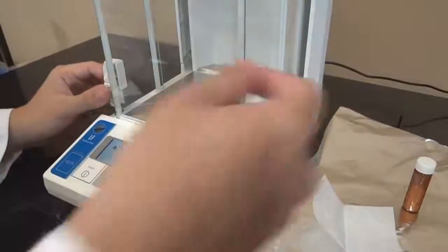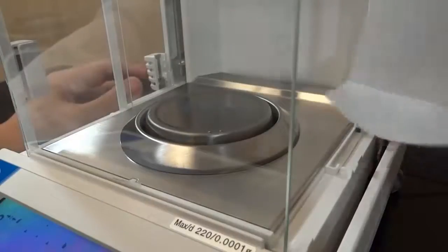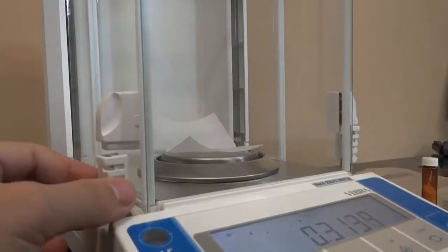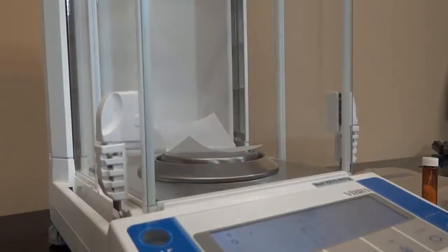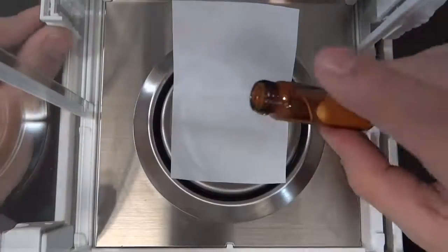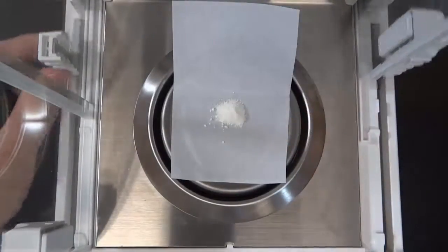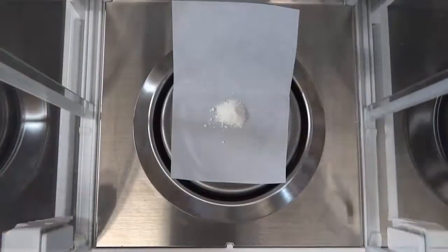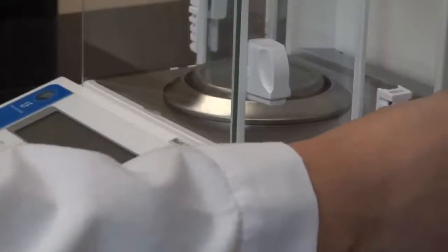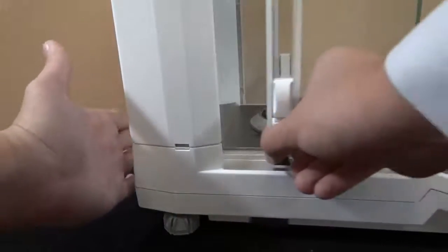To assist with sample handling, the chamber is fitted with crossover sliding windshield doors to allow opening of the opposing door. If your right hand is loading a sample, you can use your left hand to open and close the right-hand door. All three glass doors are split-nesting, meaning that they will not protrude outside the shell of the casing, thus saving space and guarding against accidents.